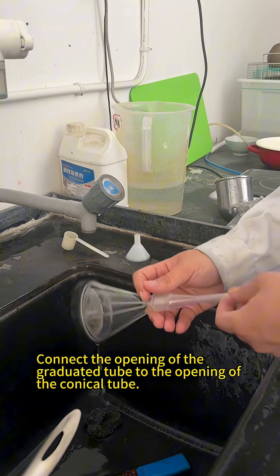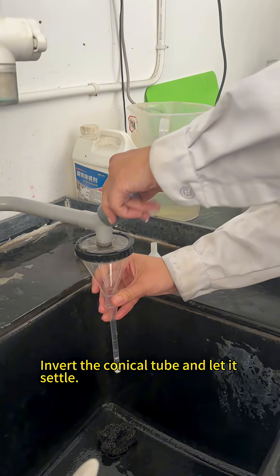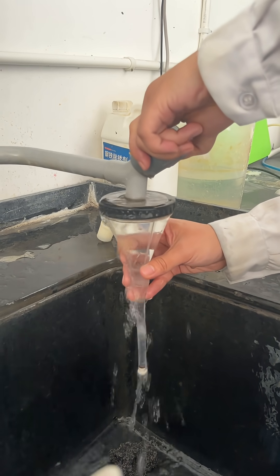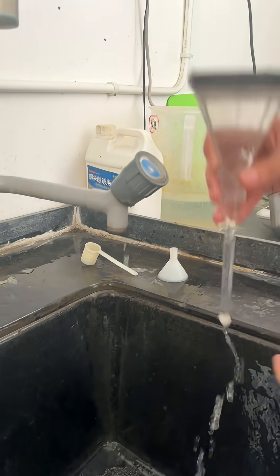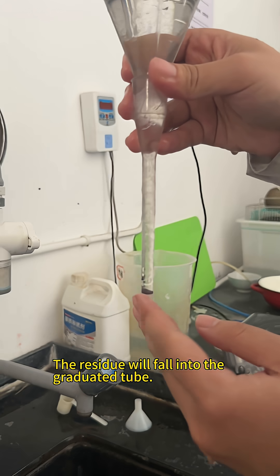Connect the opening of the graduated tube to the opening of the conical tube. Invert the conical tube and let it settle. The residue will fall into the graduated tube.